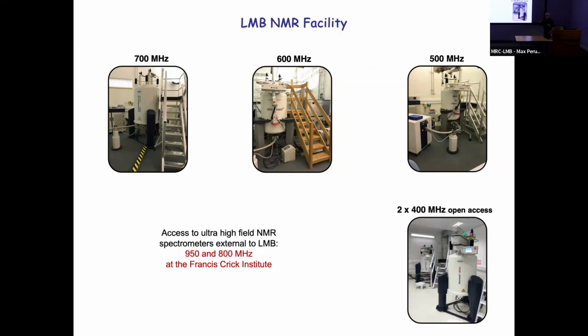These are open to any of the projects in any of the divisions in LMB. You're welcome to come and use them. And as I say, we have a permanent staff of people for you to consult about exactly how to do it, should you not already have any experience in this. If you do come in with considerable experience in NMR and you decide you just want to run the spectrometers yourselves, that's also something that we accommodate, and we have people that do that.